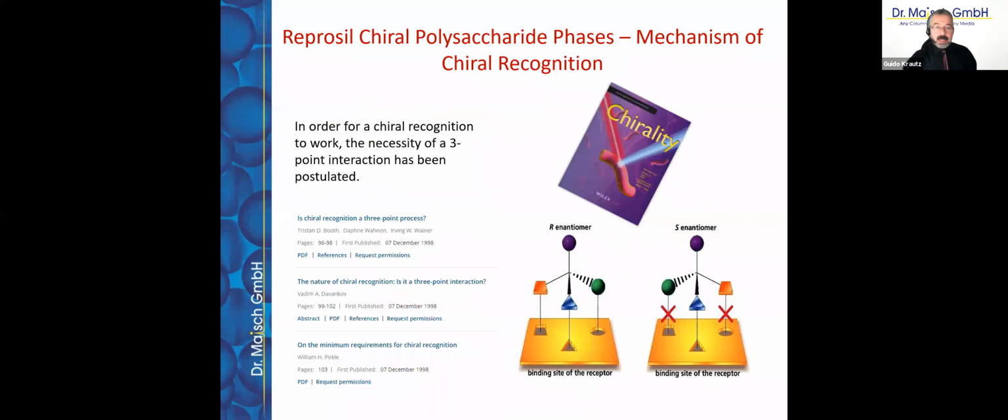So we have, oh, sorry, there's one slide before. So how does the mechanism of chiral recognition work? So it has been postulated that in order to distinguish between 2 molecules which are enantiomers, there has to be a 3-point interaction. So you can imagine this as a key lock interaction mechanism. So you see that this molecule fits into these holes here. So this is a 3-point interaction, a 3-point recognition, whereas its mirror image does not.